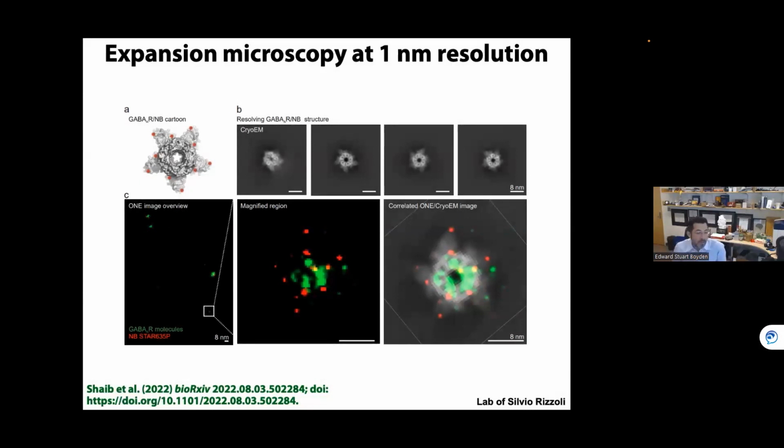Meanwhile, JB Chang, the same JB that I mentioned earlier, who used to be a postdoc in my group, has a bioRxiv preprint on expanding the entire body, what he calls whole body expansion microscopy. And they've shown that they can take the entire embryonic mouse, soften cartilage and bone, and expand the whole body. So it's interesting to see that expansion might be the first technique that goes all the way down to nearly atomic precision, but all the way to entire mammalian bodies.